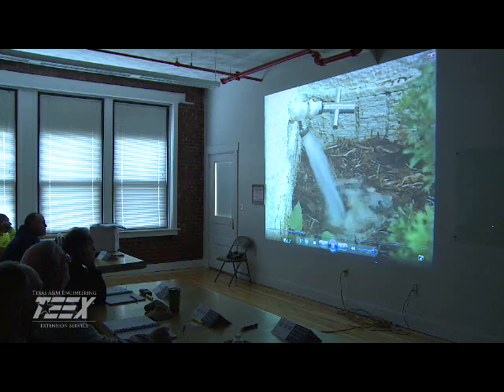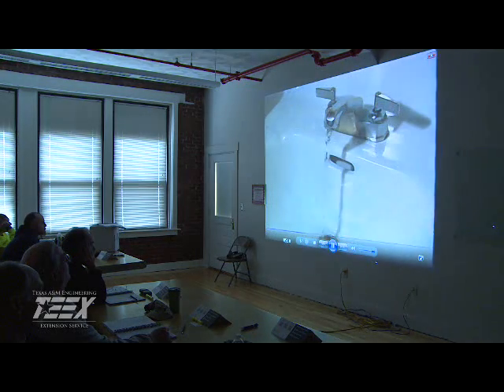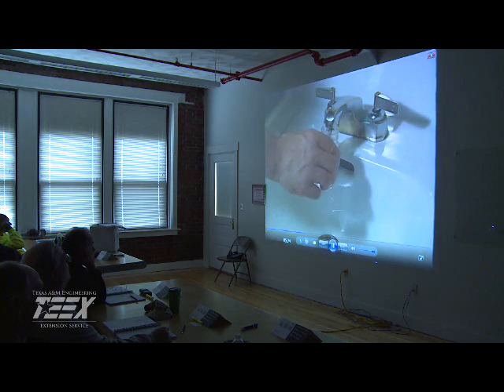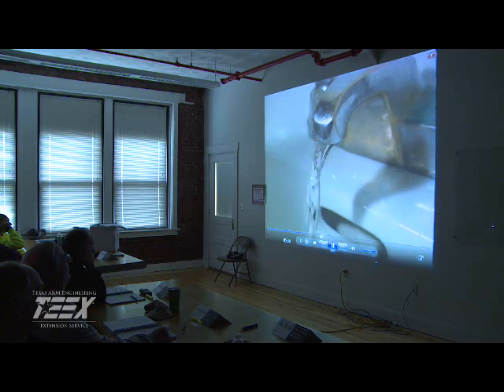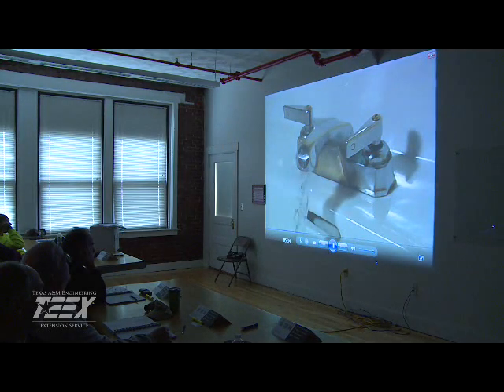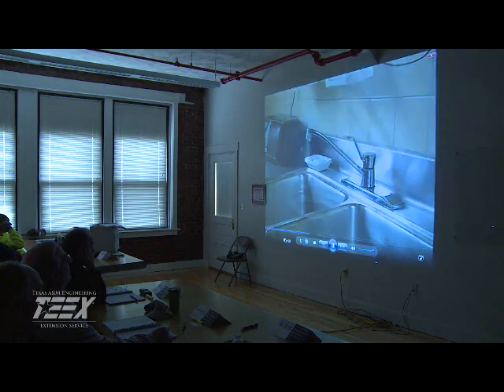A sampling faucet can't be close to a sink bottom. It's hard to place a sample bottle under a faucet that's too low. And if the interior neck of the bottle touches the faucet, the sample quality is compromised. Only cold water faucets should be used for sample collection. Don't use swivel-type faucets that have a single valve for hot and cold water. Avoid leaking faucets. Don't use faucets with threads. They usually don't provide a smooth flow.